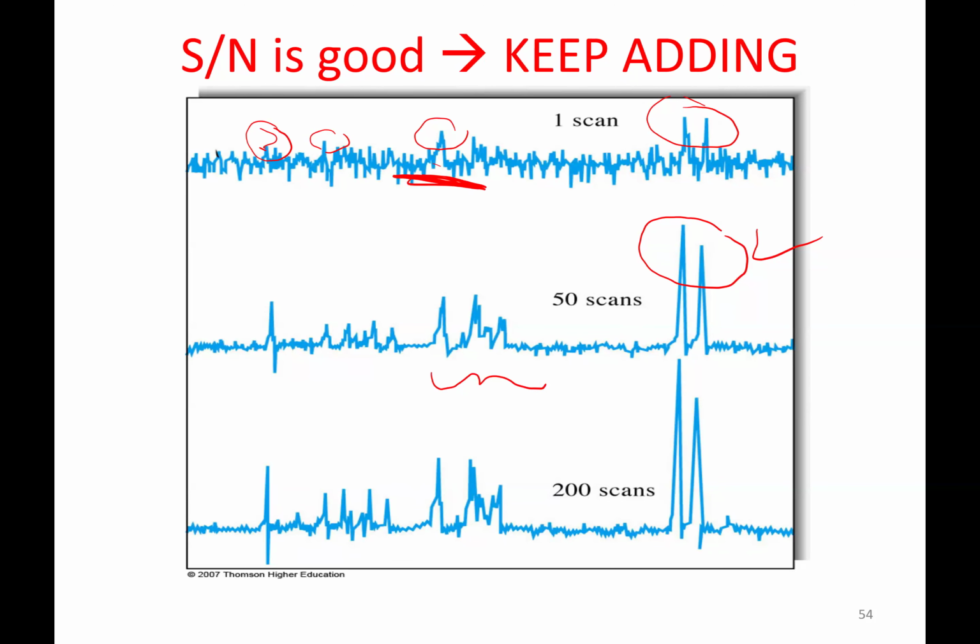And the more scans, the better. By the way, when you look at this, it's not to scale. Are we together? It should be taller. All right. But what we are illustrating here is the fact that the more the scans, the better for you to see the signal. We together there? So that's what this diagram is illustrating.